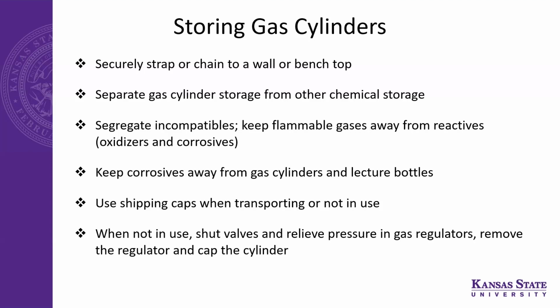Again, the question is indoor storage or external storage? So it's external and internal both? Again, that's going to go back to the Compressed Gas Association standards; you're not going to find a deep bench of regulations in OSHA. And again, what PSI is it under? Is it going into a bulk system? Is it individually feeding? What's the plenum look like?